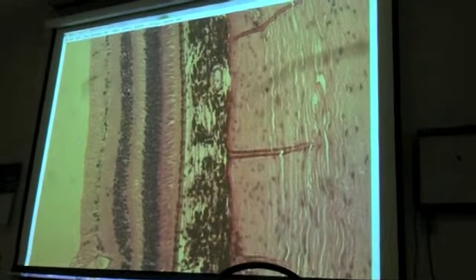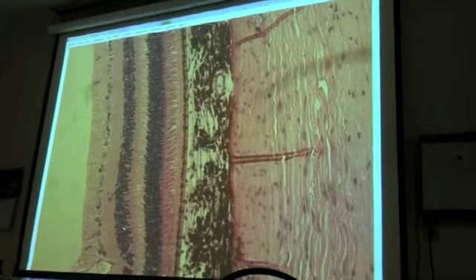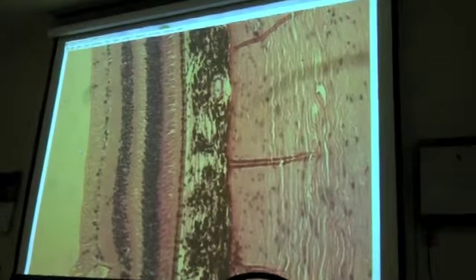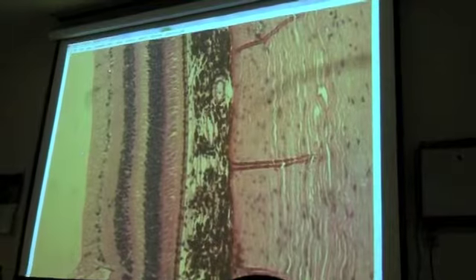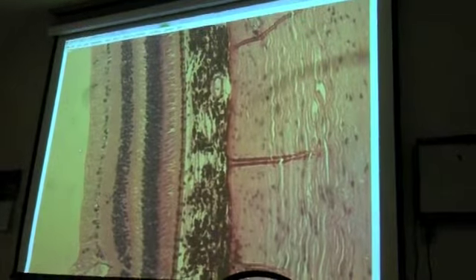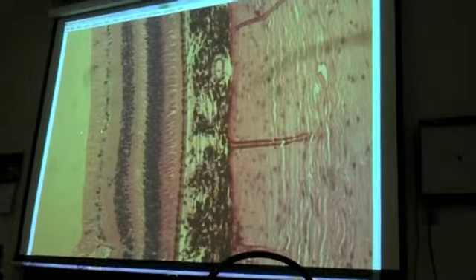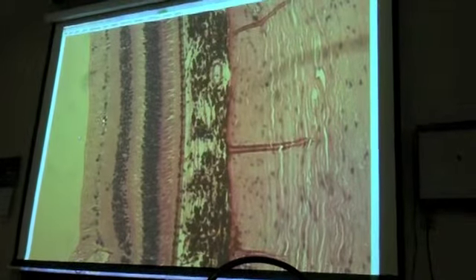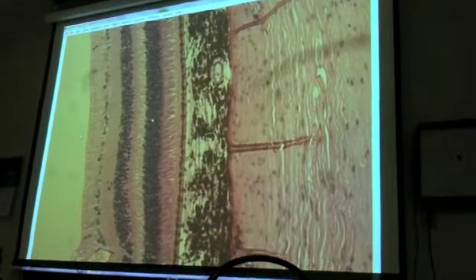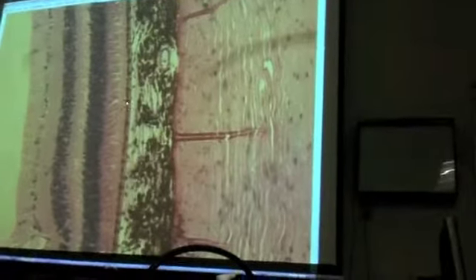This is the bipolar cell layer, so those are bipolar neurons. Those are only found in sense major sensory organs. And then this is the ganglion cell layer. So these are a single cell layer of ganglion—they're called ganglion cells. And what I'm pointing to are the nuclei of ganglion cells, bipolar cells, rods and cones. We're not differentiating. And then the last part of the retina is this pigmented layer.